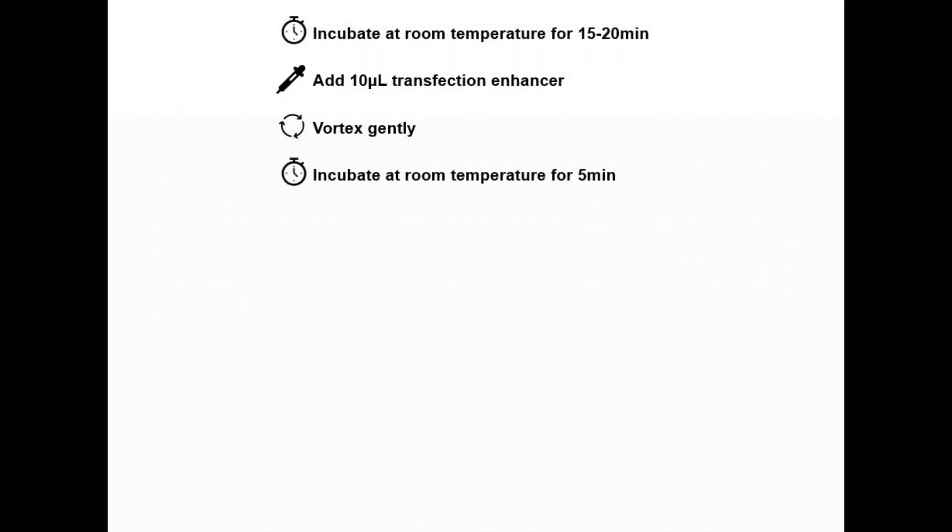Next, incubate the mixture for 15 to 20 minutes at room temperature to allow complex formation. Then add 10 microliters of transfection enhancer reagent, gently vortex, and incubate for an additional 5 minutes at room temperature.